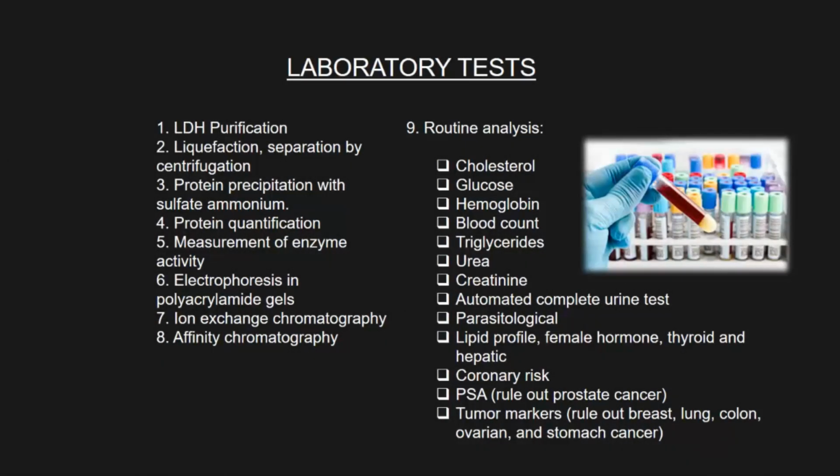Hi teacher and classmates, now I will talk about laboratory tests. 1. LDH purification. 2. Liquefaction, separation by centrifugation. 3. Protein precipitation with ammonium sulfate. 4. Protein quantification. 5. Measurement of enzyme activity.